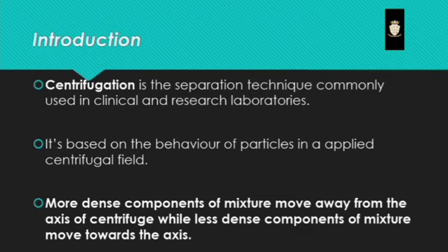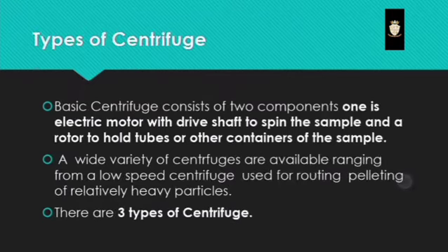Introduction. Centrifugation is the separation technique commonly used in clinical and research laboratories. It is based on the behavior of particles in an applied centrifugal field. That is, more dense components of the mixture move away from the axis of the centrifuge, while less dense components of the mixture move towards the axis.